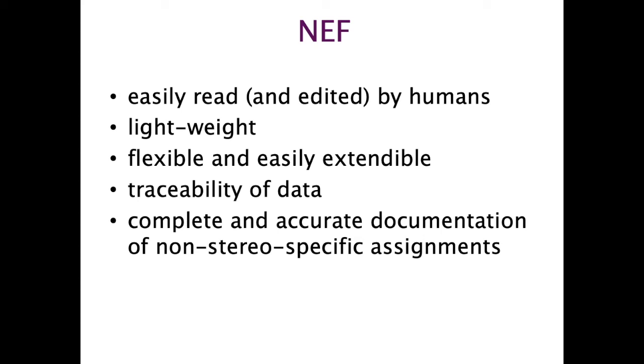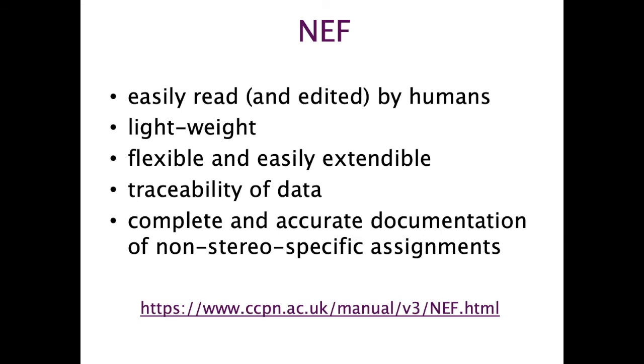A NEF file in association with a corresponding MMCIF file will tell you which chemical shift relates to which atom, even when you've got non-stereospecific assignments, and when that assignment varies from model to model within your ensemble. Most of the documentation around NEF so far has been geared towards developers. We've now got a little bit of information here on our website for users.